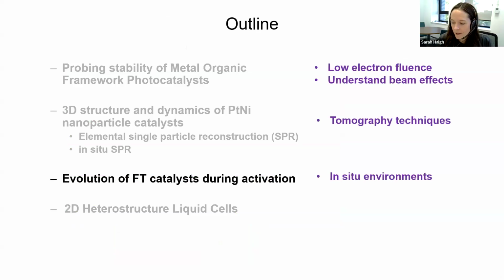Great, so the next 5 or so minutes of the talk, I wanted to tell you about how we can do some experiments which are under much more operando in situ conditions. I've told you so far that I had to compromise in order to apply single particle reconstruction initially and just do the experiment heating in the vacuum of the TEM. And for the next project, I want to tell you about how we're using a gas cell, which allows us to put actual gas chemistry at 1 bar pressure inside the TEM and image our sample and see how it behaves.